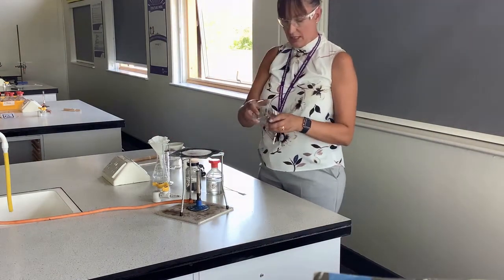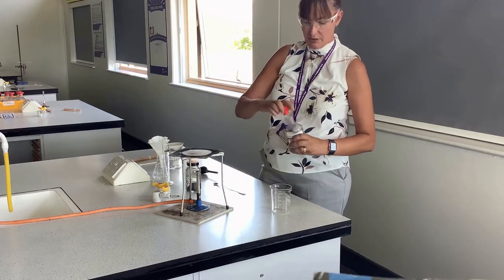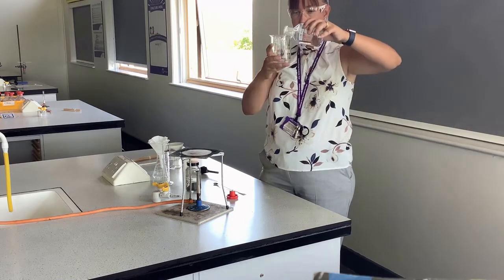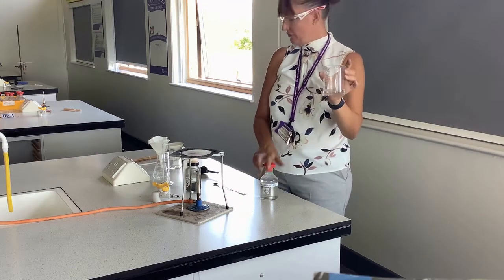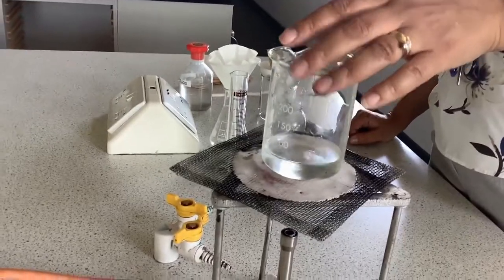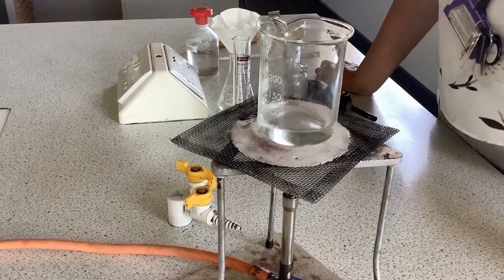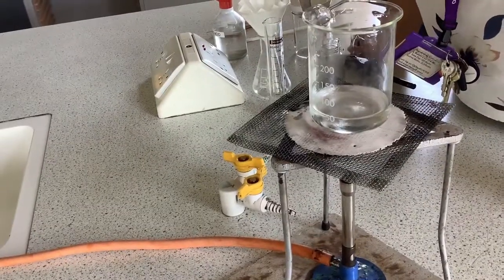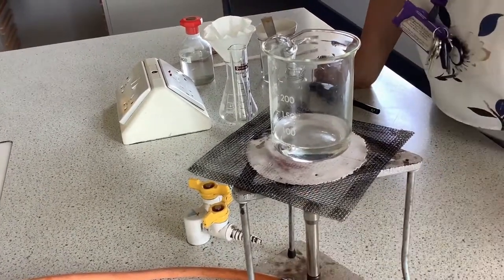First of all I'm going to take approximately 50 centimetres cubed of sulphuric acid. This isn't a quantitative experiment, I don't have to be super accurate. You can see that sulphuric acid is colourless. I am going to heat the sulphuric acid, but I'm not going to boil it because we don't want fumes of sulphuric acid being produced. I'm going to heat it on a blue flame.